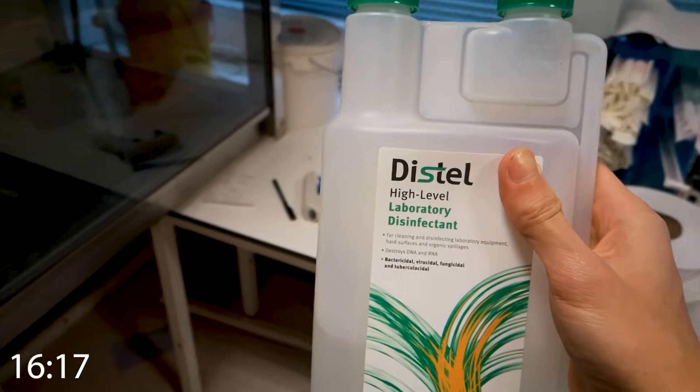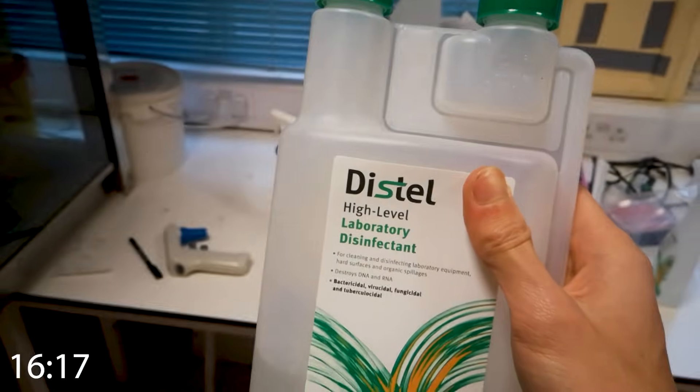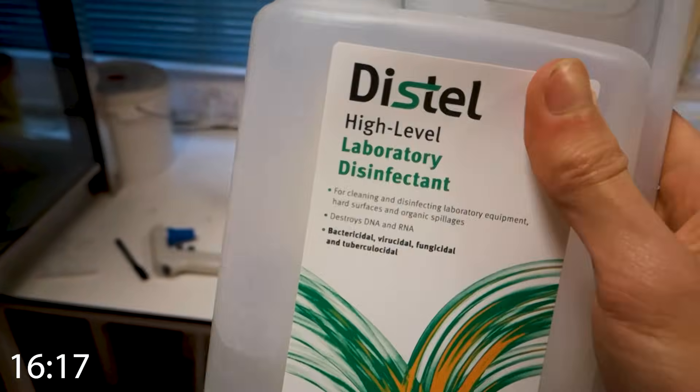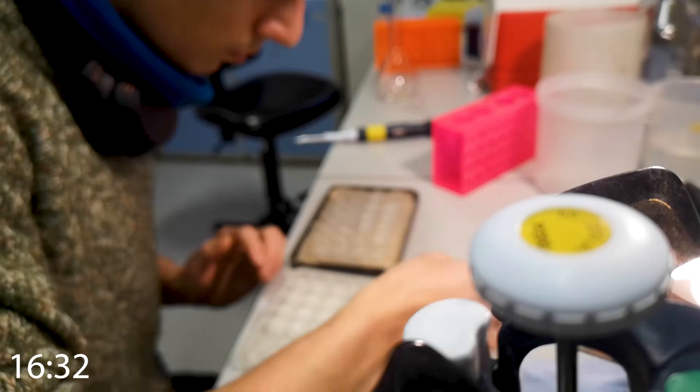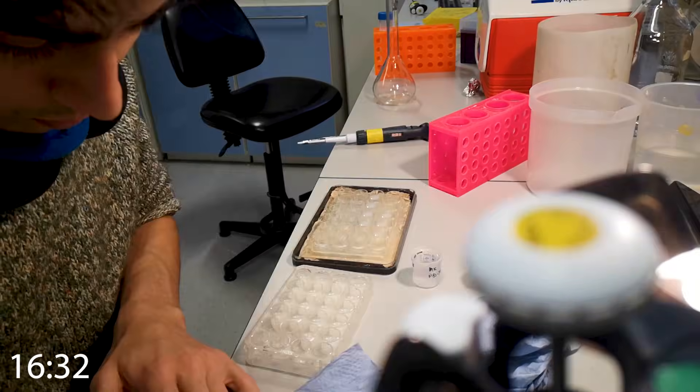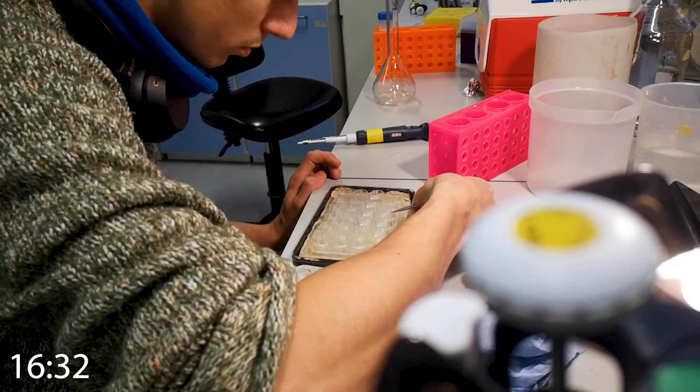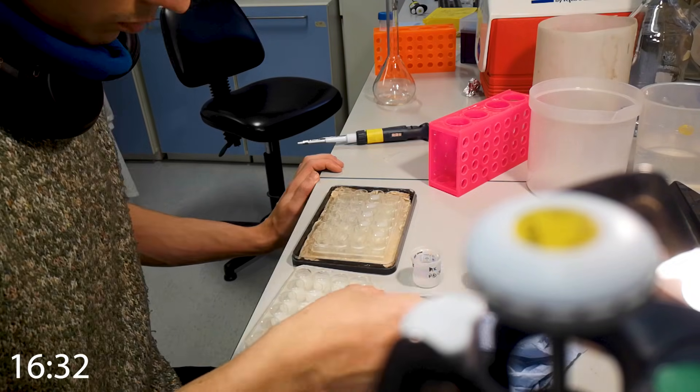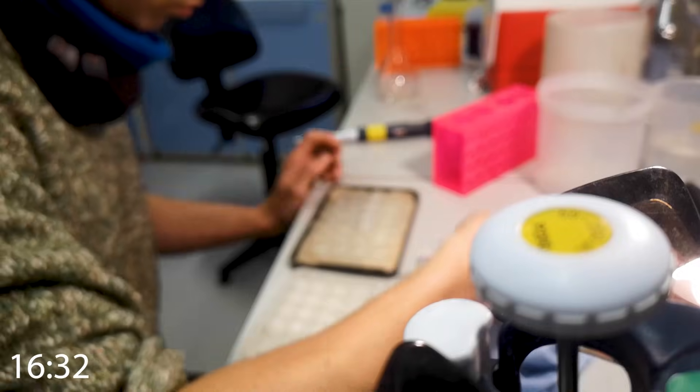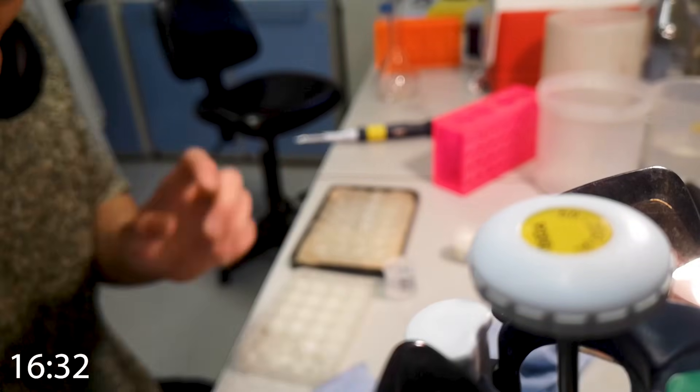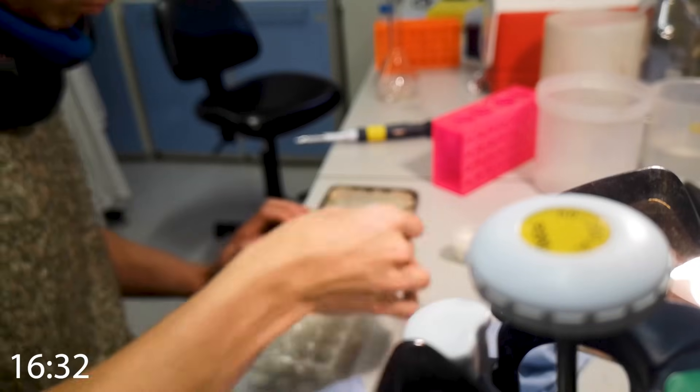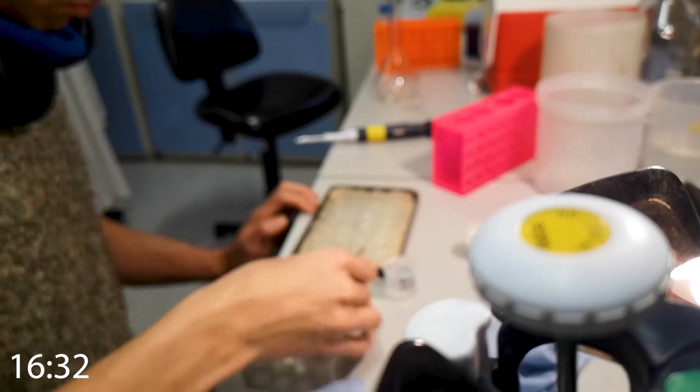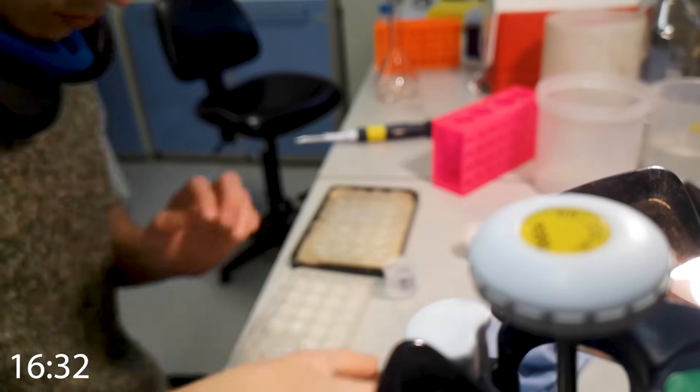We use this stuff to clean the pump switch, drink up all the cancer cells. This is like bleach, but 10 times worse. On a bad day after restraining myself from drinking it, I then go back to the lab and continue preparing my samples, which I'll then be looking at under a microscope tomorrow. You might be thinking, surely it's going to be done by now with the samples, but I wish. It takes like seven or eight hours to prepare my samples, and if I do one step wrong, then it's all for nothing, and I've wasted hundreds of pounds worth of lab money.